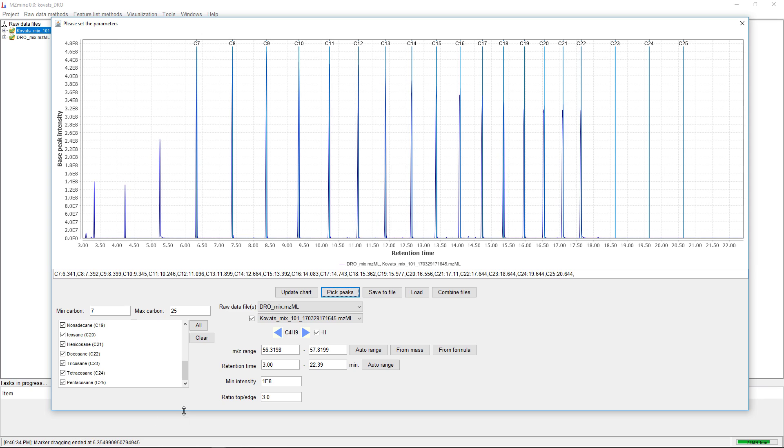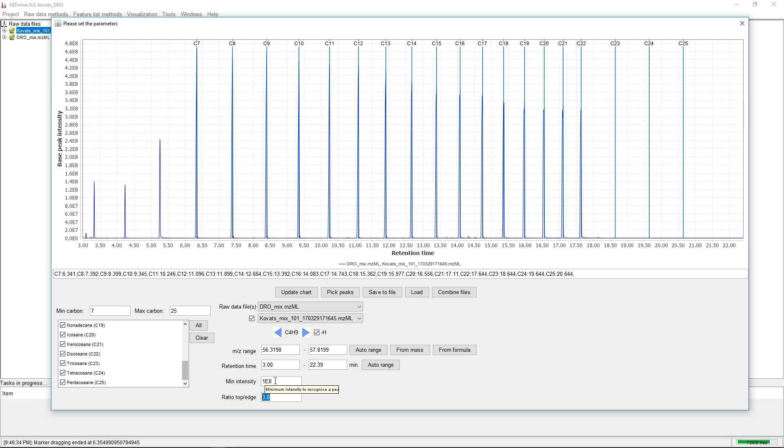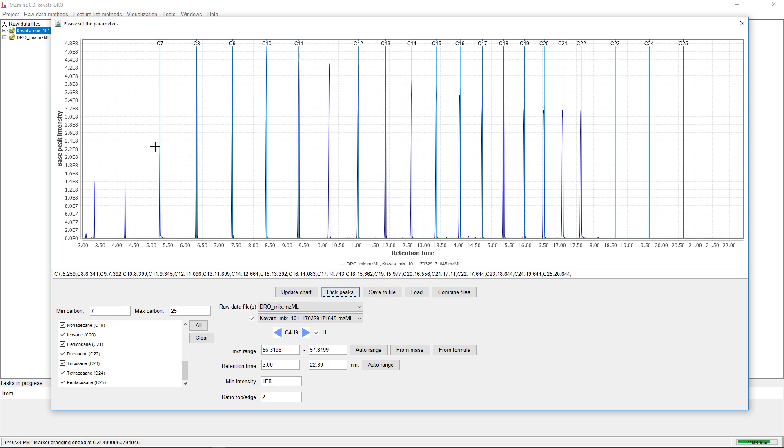They are above the minimum intensity, but the ratio top to edge is too high. If we set this to something lower, we can at least pick this one.